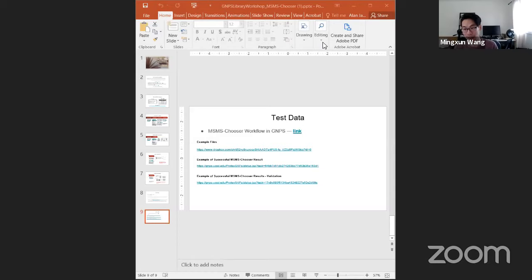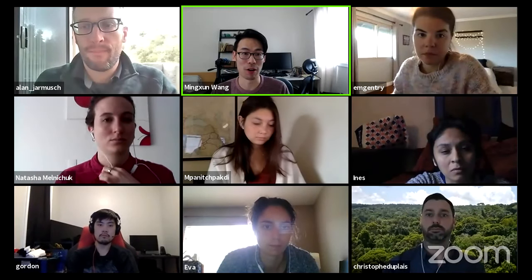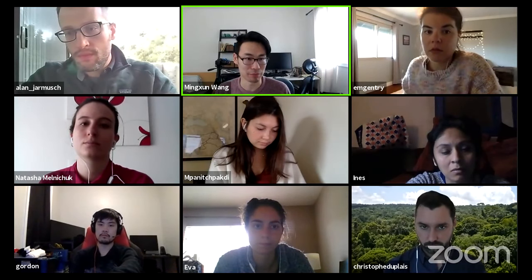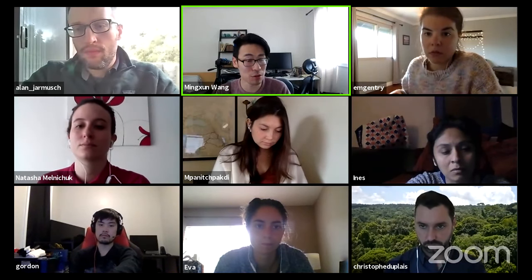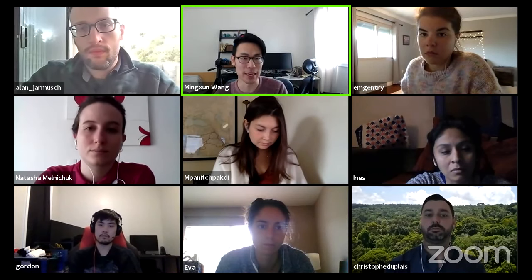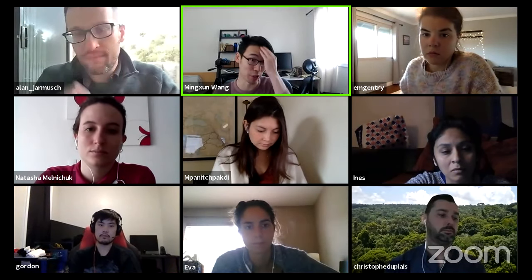Again, there are caveats, as Alan had mentioned: if there are multiple MSMS for a given structure that it found, how does it choose the best one? For us, we choose the most intense precursor intensity. That's a heuristic that we use. Hopefully that'll save you time instead of manually combing through.